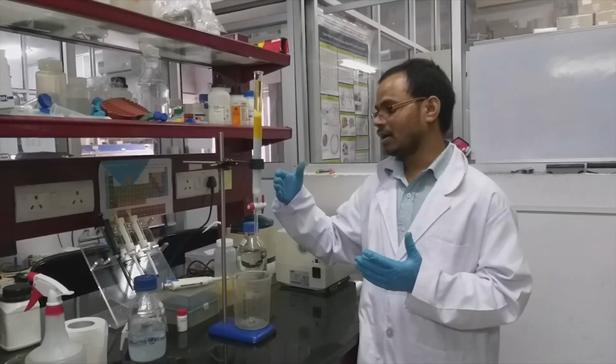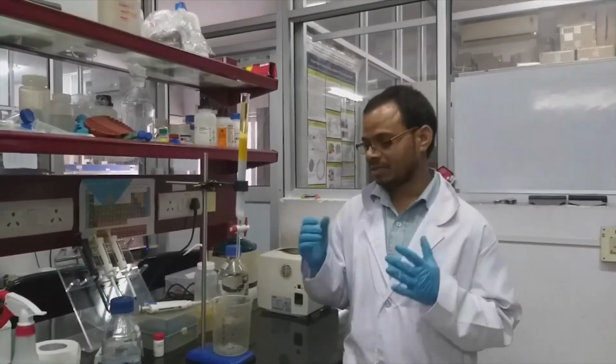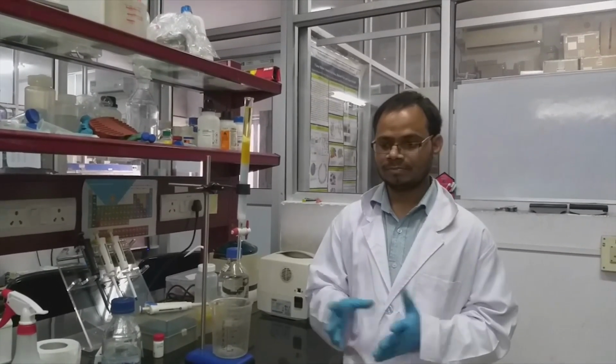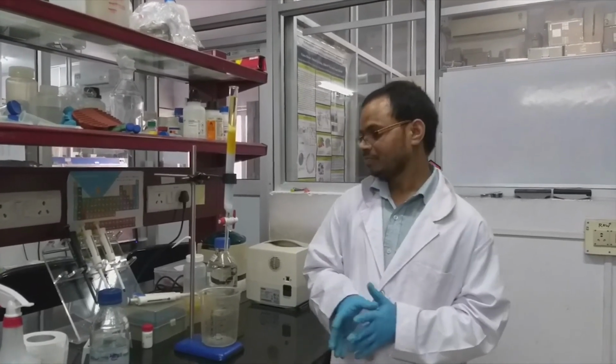Once the separation is over, you have to wash the column with a sufficient amount of buffer and water, and also 0.2 normal sodium hydroxide to remove any suspended particles or any proteins. After that you can store it in 20% ethanol for further use. You can use it as many times as you want till the beads retain their activity.